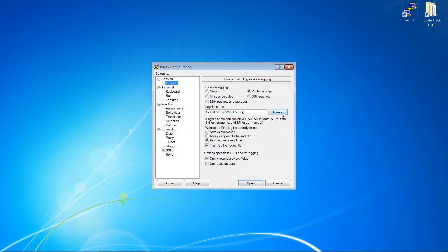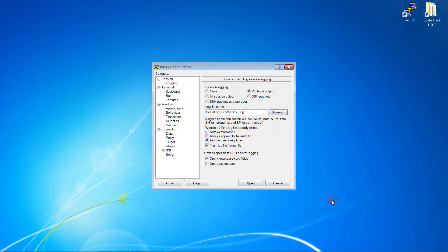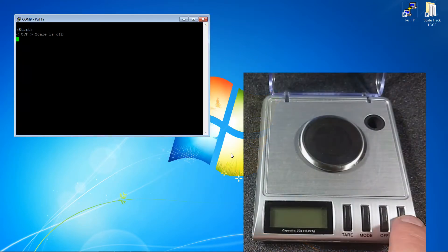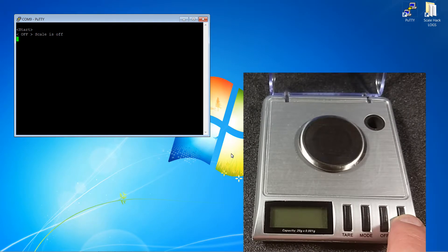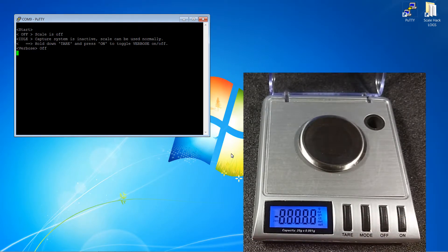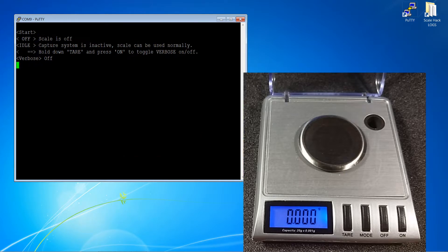The file is created when you open the session window and data is written to it during the session. When first powered on, the capture system is in the idle state and a one-off message shows you how to toggle verbose messages on and off.